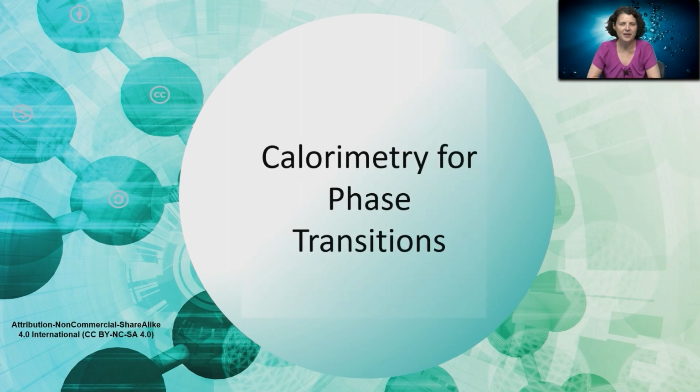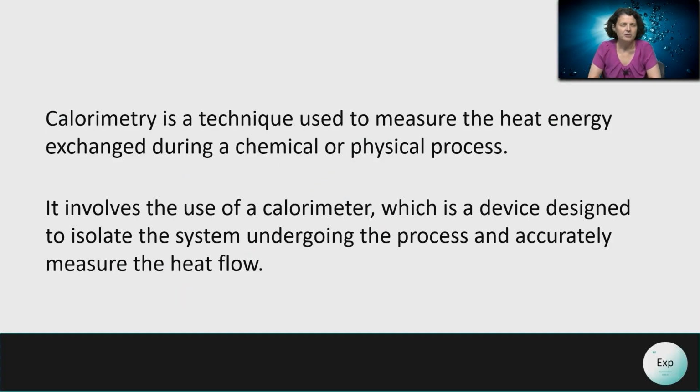My name is Dr. Esther Trufan, and in this video, I'm going to explore another application of a calorimeter. Calorimetry is a technique that we use to measure the heat exchanged between two chemical or physical processes. And in order to do this, we use a device called a calorimeter.